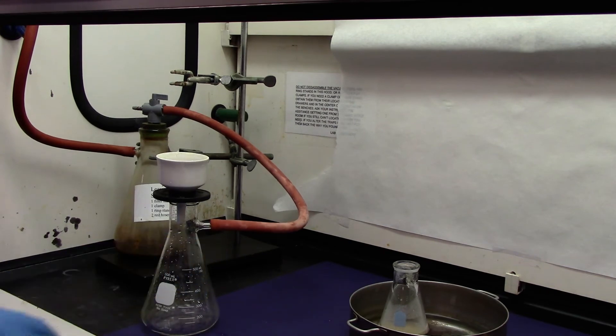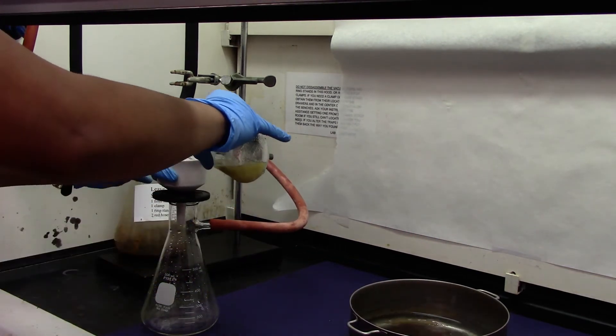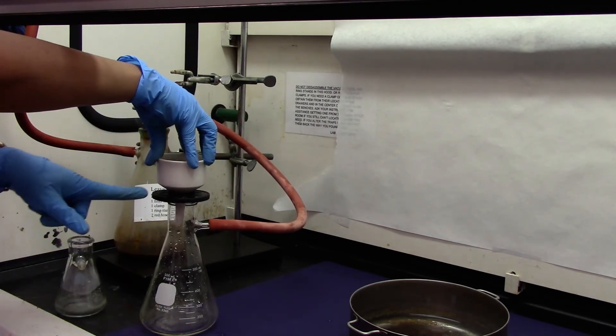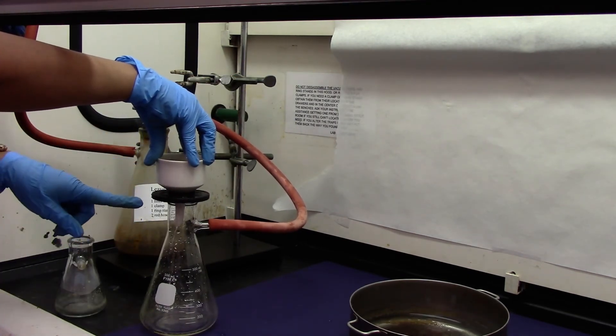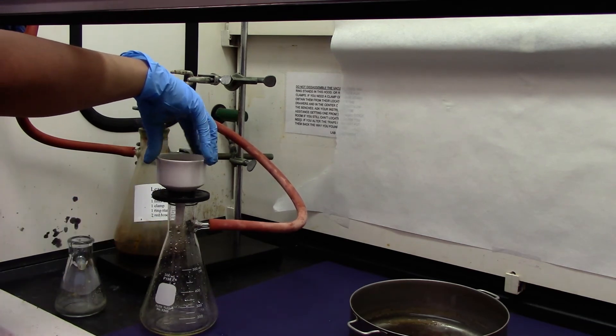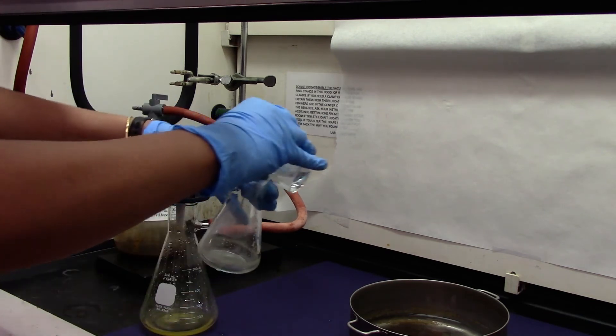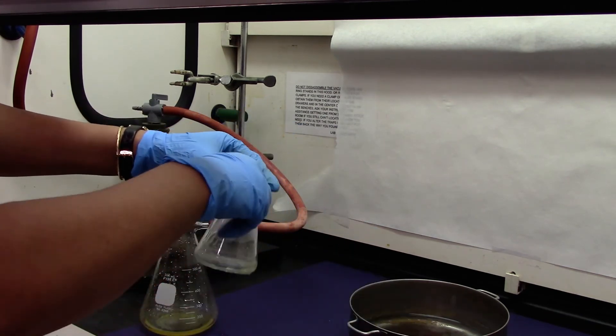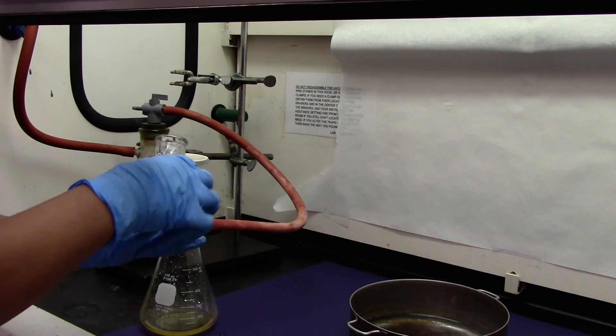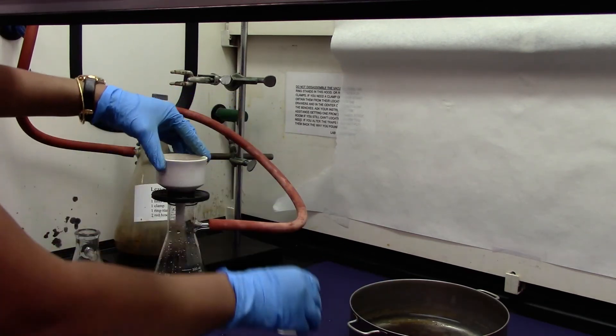Turn on the vacuum and then transfer your product solution. If you press the funnel for a few seconds it will seal and the filtration will be fast. We can rinse the flask with some cold DI water and rinse our crystals.